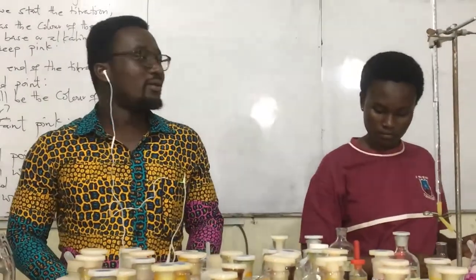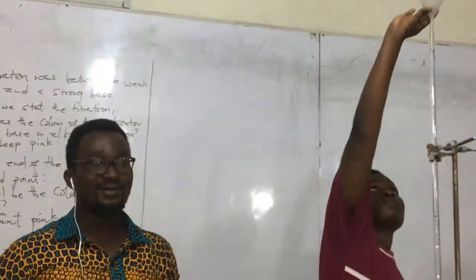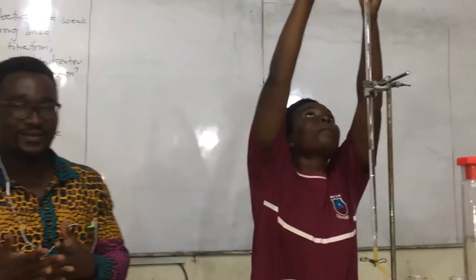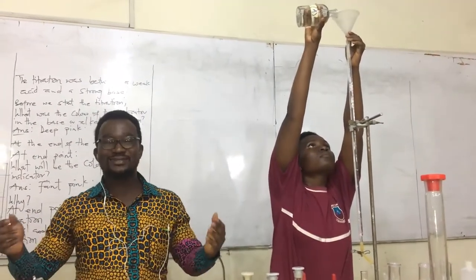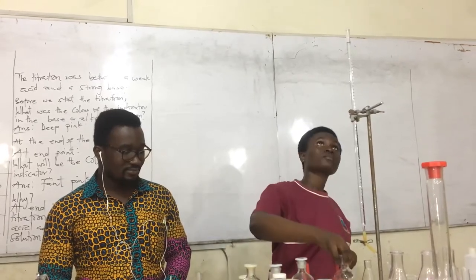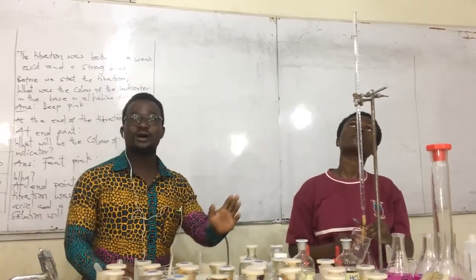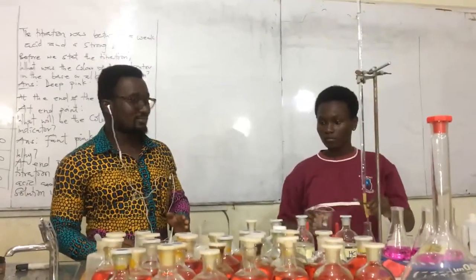Okay. So she's going to begin. Notice the color change. Our madam is very keen in terms of handling the apparatus. Very comfortable. That is how you are supposed to behave, very comfortable in handling the material, so that when you leave this our continent, you can fit in anywhere. So she's brushing out the air bubbles.